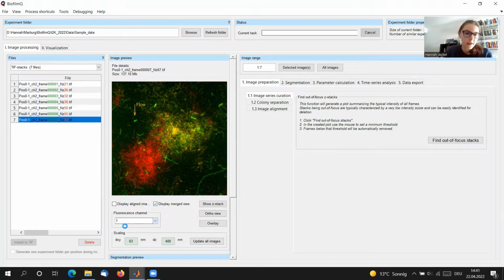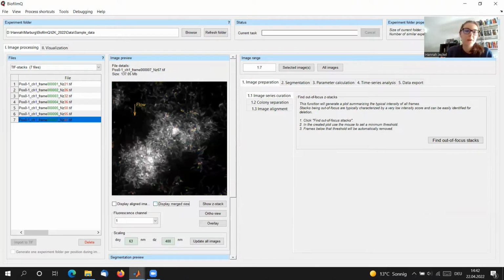I will move now back to channel number 1, because that is the channel that we want to focus on, that we want to perform segmentation on. Because in BiofilmQ, it is important that you are always capable of doing some kind of segmentation. So it's good to have a continuous signal, such as the one here, where every cell just carries this one signal that can be used for segmentation. And then the second channel can be used, for example, to distinguish cells that belong to these 2 different subpopulations.